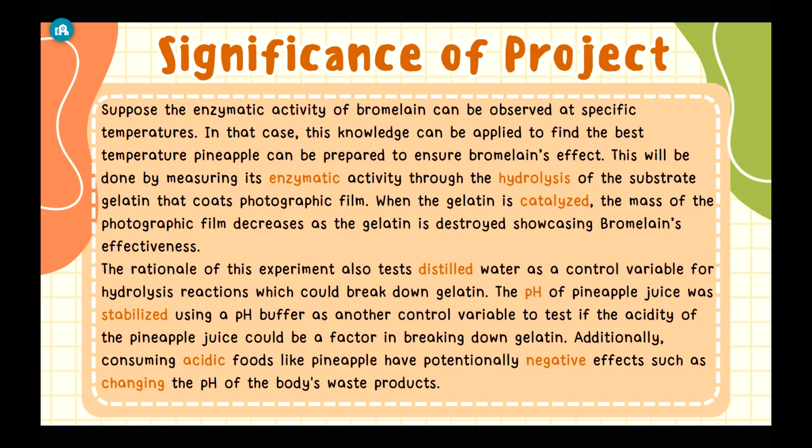This will be done by measuring its enzymatic activity through the hydrolysis of the substrate gelatin that coats photographic film. When gelatin is catalyzed, the mass of the photographic film decreases as the gelatin is destroyed, showcasing bromelain's effectiveness.